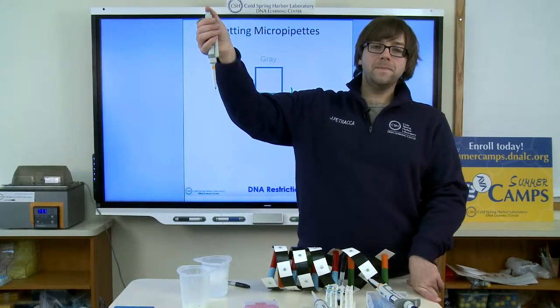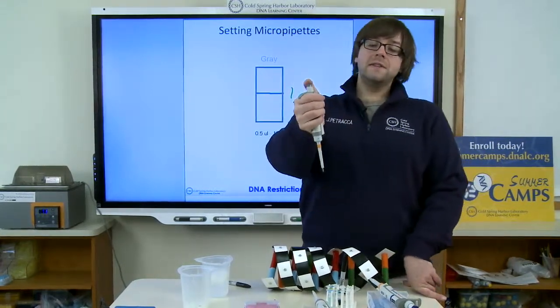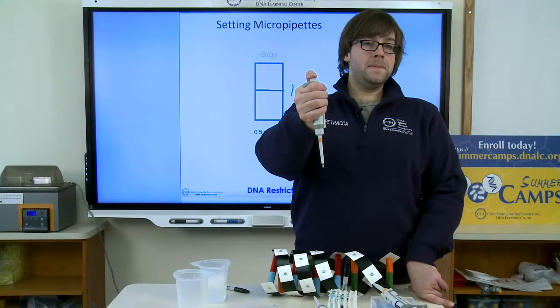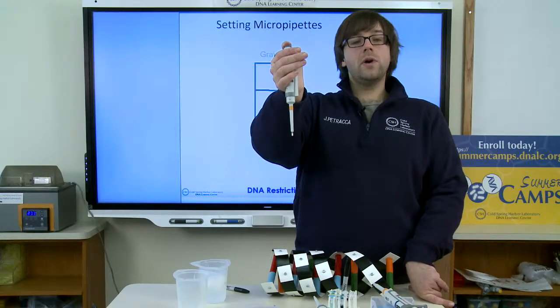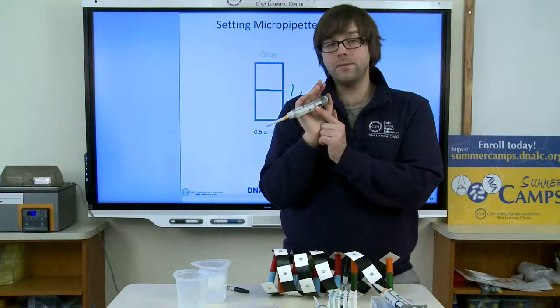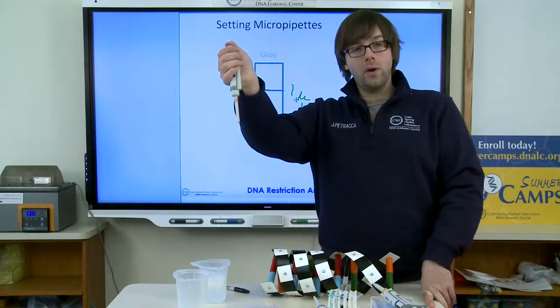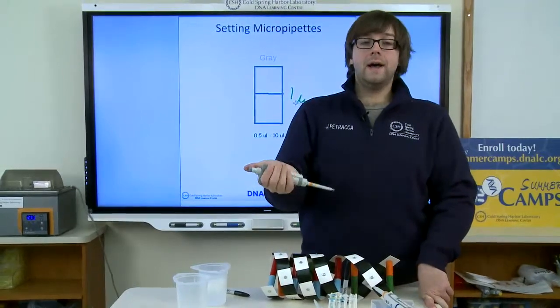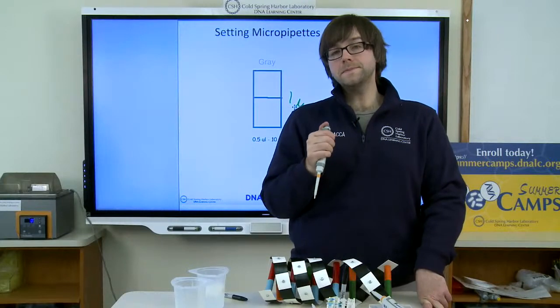Now with the plunger, with the button up on top here, when I push down, or if you guys have ever had the opportunity to work with a pipette, you may have pushed down on this button and you'll notice that there are actually 2 different places that you can stop the button. If you push really, really gently, you'll encounter a little bit of resistance. We call that the first stop. That actually pushes out the exact volume of air that the pipette is set for, that those 4 numbers on the outside are set for. If I push a little bit harder, I can push the button all the way down. We call that the second stop. That pushes out a little bit more air than whatever the pipette is set for. So they have 2 different functions when we're working with a pipette.